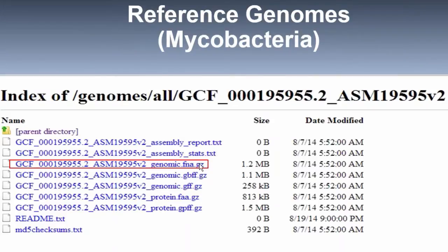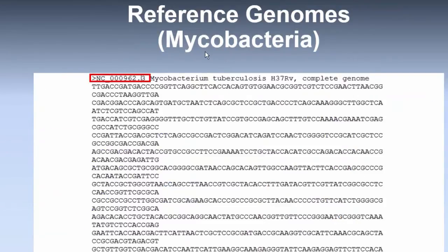Now, the thing we've done with the FASTA, and I'm very proud to say we've done this, is we have changed our genomic FASTA files such that they will work with popular RNA-seq analysis software such as Bowtie, HISAT, and STAR. So if you index these genomes for Bowtie, HISAT, or STAR, and then you use Cufflinks, Cuffdiff, or DESeq, you will get actual expression, transcript expression values or gene expression values, depending on what you're trying to do.